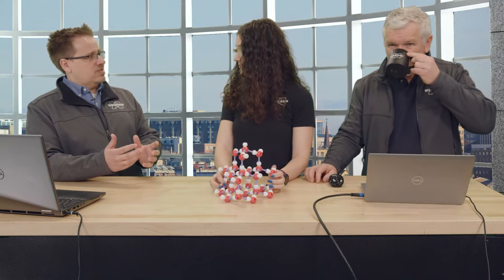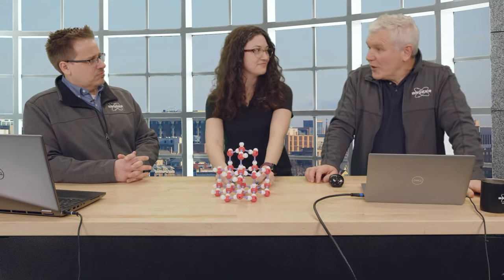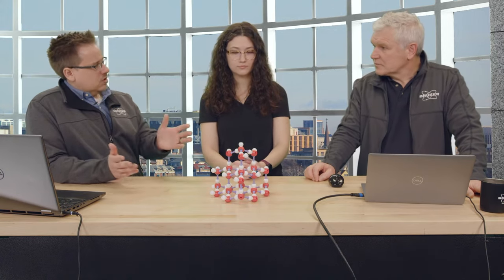Oh, okay. So it could actually be something like an interstitial or substitutional defect in the structure? No, I think that would be really something different. There are different kinds of modulations. There's positional modulation. This is what Ashley just talked about. But then you could also have occupational modulation, where there's a modulation wave running over the structure where sometimes it's a manganese and sometimes it's a calcium in some mineral, for example. Okay, so a substitutional defect you would see if it's on an ordered, long-ranged order piece.